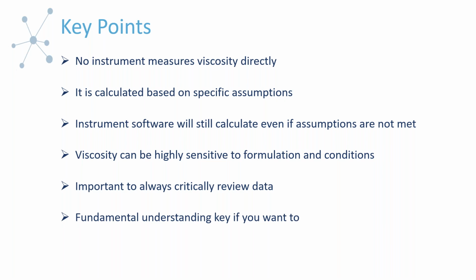As you develop a more basic understanding of rheology and the instrumentation, it's going to be very valuable to you, I believe, because it's really going to help you consistently generate high quality data, which is your goal anyway, and then allow you to properly interpret this data. Also, if something is going wrong, you're going to be able to more efficiently troubleshoot and take care of the situation.